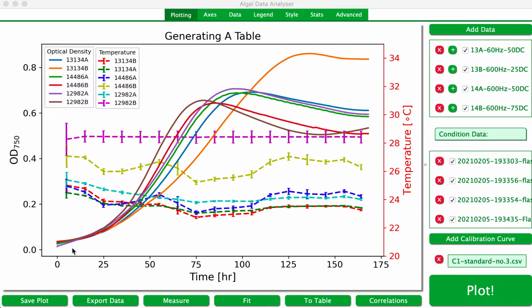So here, this is some of Alginity's Algin Pro data which I made using Spirulina, and of course many different parameters are measured using this. I've just plotted temperature here as an example. This is the same data set I used for my correlation plot video, if you're interested. And there are many things that I might want to do to analyse this data.